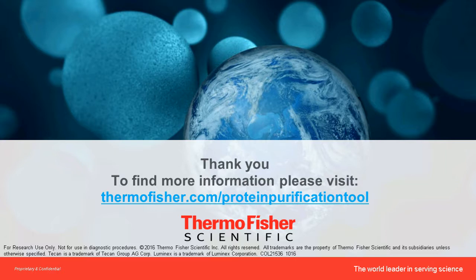Excellent. Thanks, Bhavin. And our next question asks, what type of instrument do you need for these experiments, and can a core lab help this individual set up an experiment? So this is Andreas. I'll take that question. In principle, a core lab should be able to help you if they have a functional mass spectrometer.